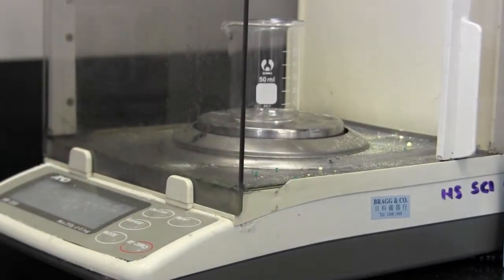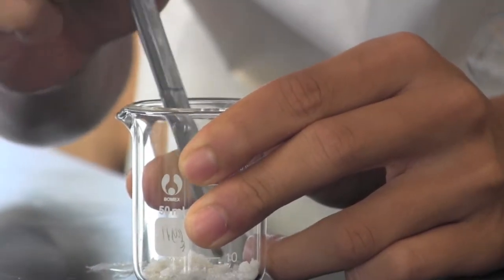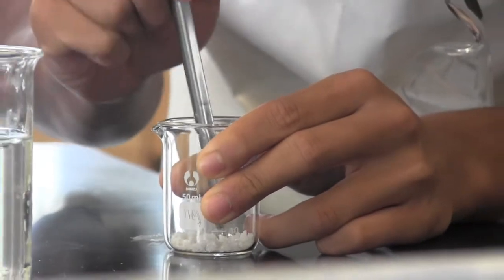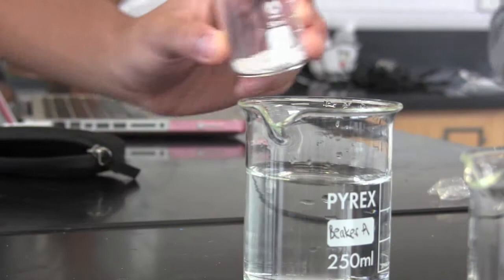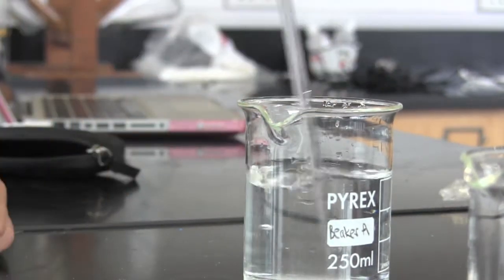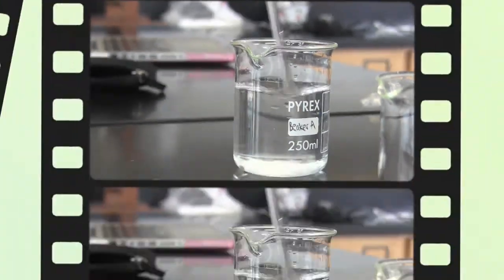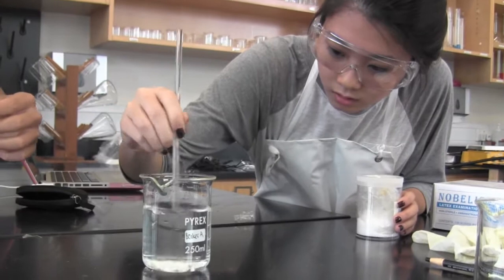We then added 4 grams of lead 2 nitrate into another beaker. We crushed the lead 2 nitrate and poured it into beaker A. We made sure the lead 2 nitrate was completely dissolved in beaker A and tested for the pH.